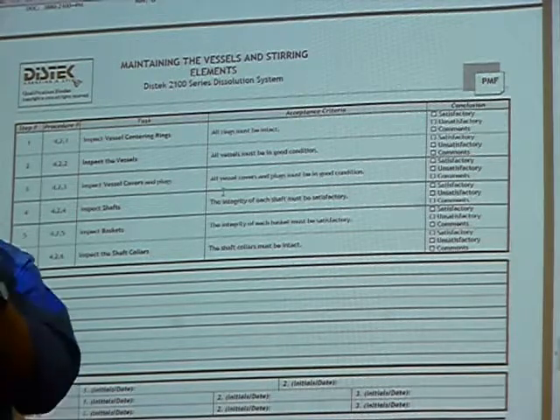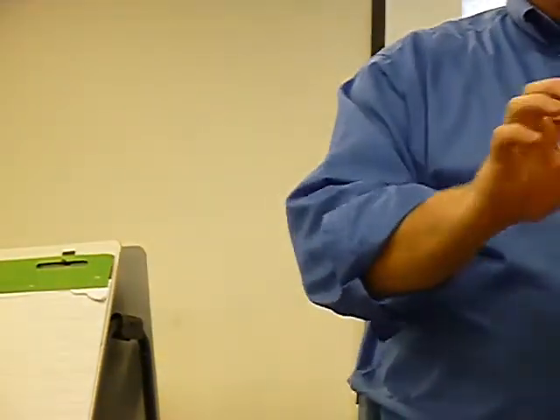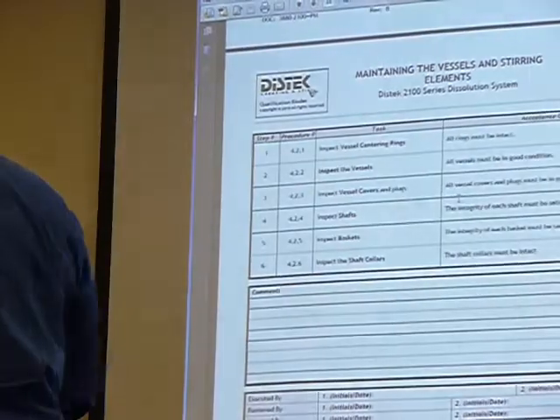And this is the vessel centering ring. This goes on our bath units. So I need to inspect it. I typically clean it. You sometimes get a little ring of mold around it. I make sure that it's sitting in good repair, good order.